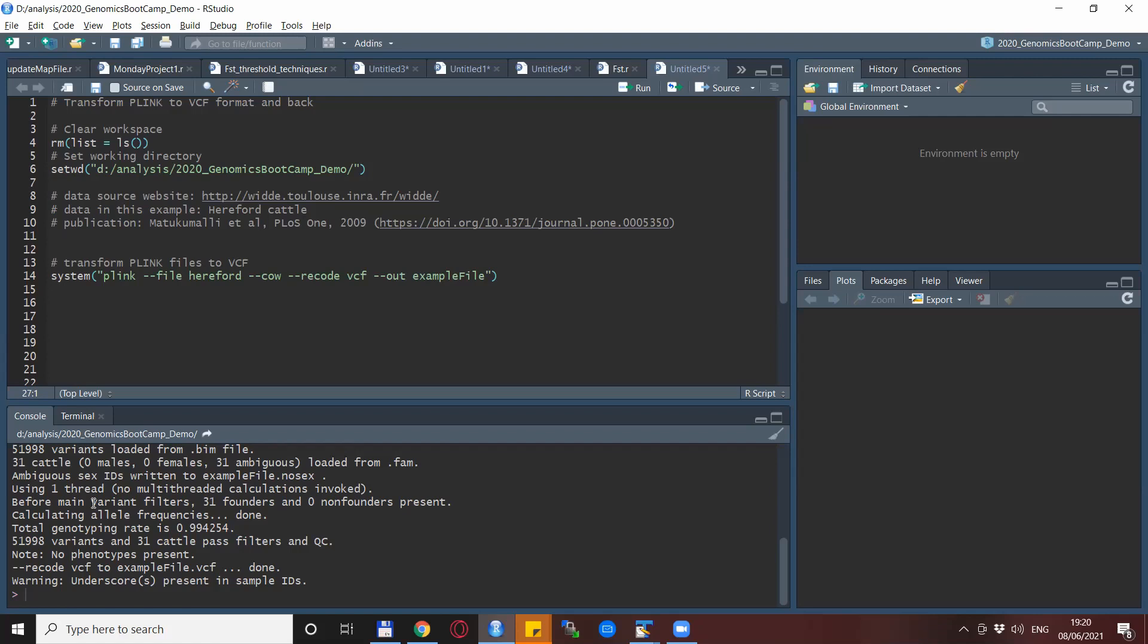Now there is a little warning here that underscores are present in sample IDs in this particular example. Here it is not a problem but it will become an issue if you want to transform VCF IDs to Plink file which contain underscores. So let's demonstrate this situation and this possible source of error.